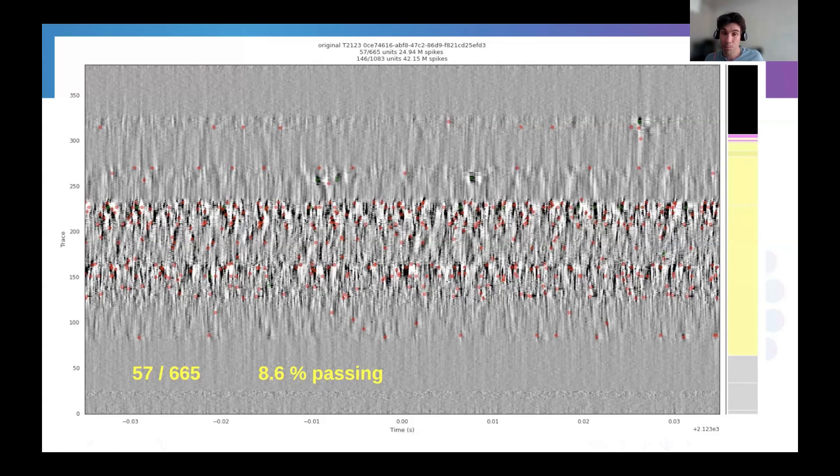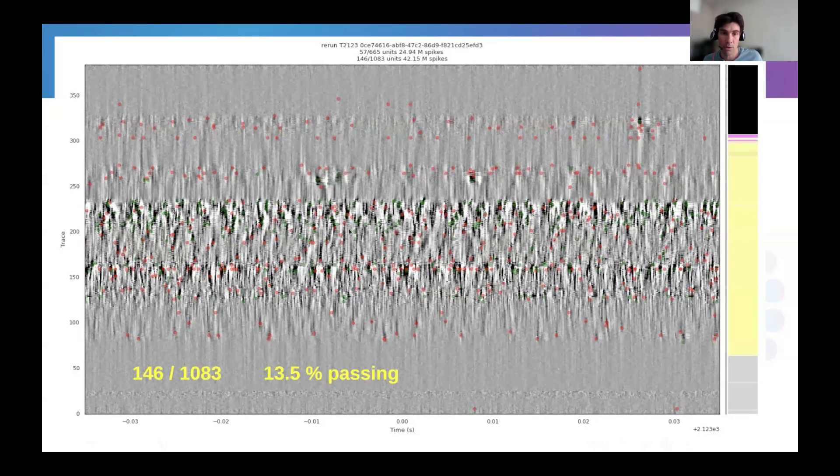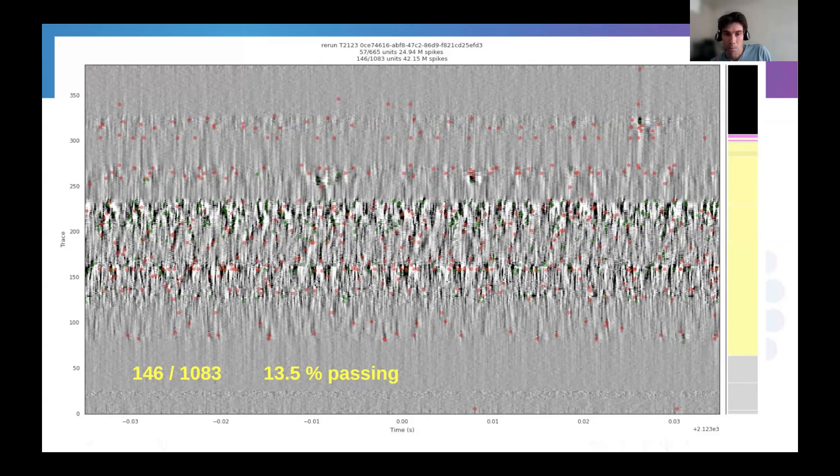But if we set the threshold too high, then the spike sorter does not find enough spikes to support the reconstruction of the clusters of the full cells themselves. And what we figured out is that this is probably what happened. Because if we lower the threshold here at a different level, we still get many bad units. But we get more good units and especially more spikes belonging to the good units. As you can see before, this is the same data defined by sorting with lower thresholding. So here it's really a matter of trial and error. The problem, I think, is part of the future work is that it's probable that those thresholds are region dependent. It's not the same if you're working in cortex than if you're working in the cerebellum. The optimal threshold may be different.